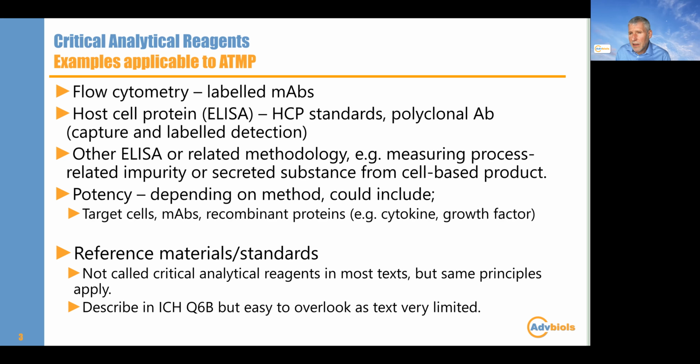Reference materials are described separately in the few guidances that mention critical analytical reagents. I think they're not necessarily called critical analytical reagents, but everything I'm going to say, or everything that you'll read when you look at some of the references later, applies really to reference materials as well, plus a little bit more. It's really not very well described in ICH Q6B, and I toyed with giving a talk on that topic actually, but chose this one instead.